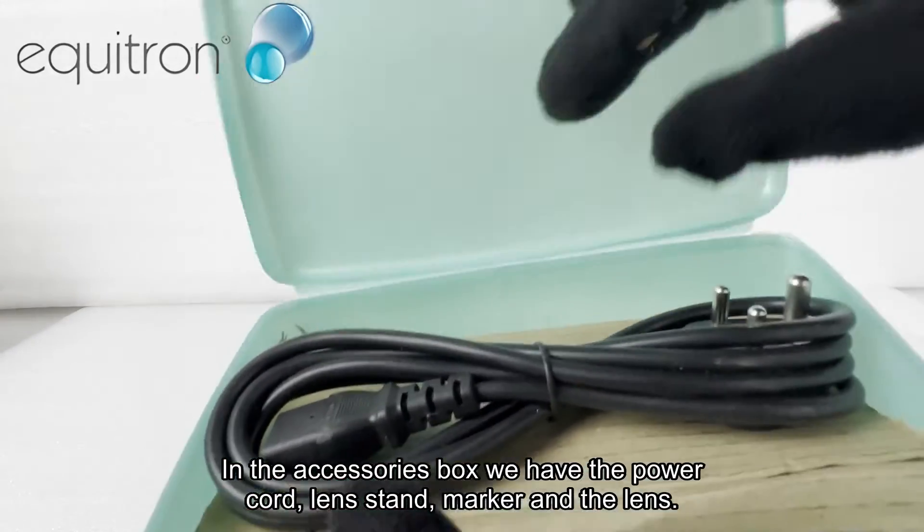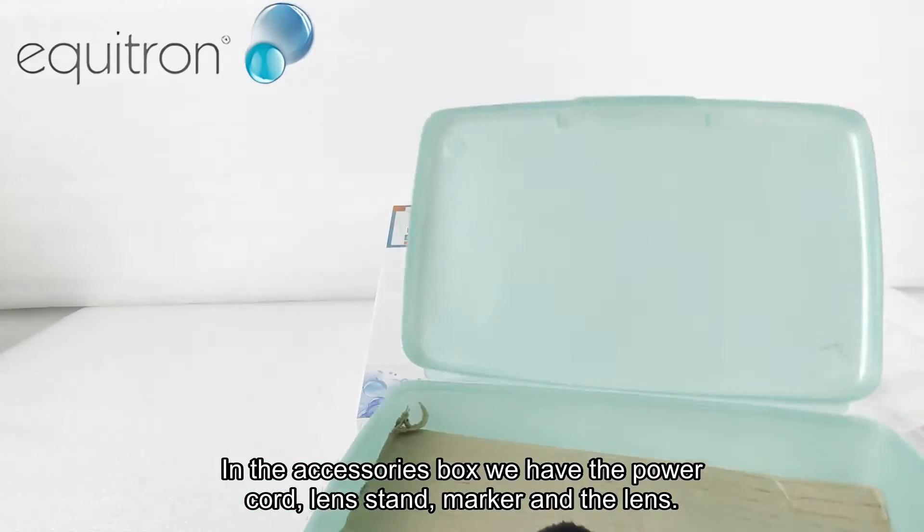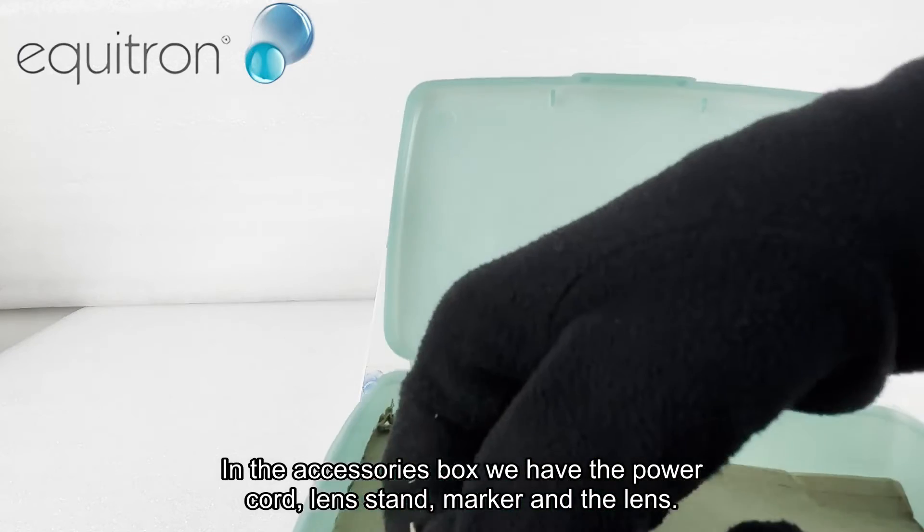In the accessories box we have the power cord, lens stand, marker, and the lens.